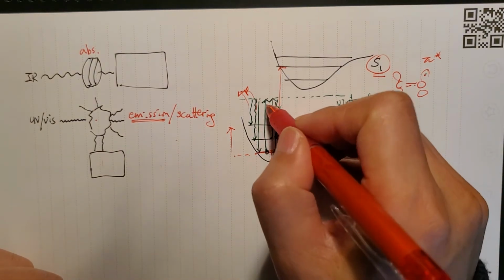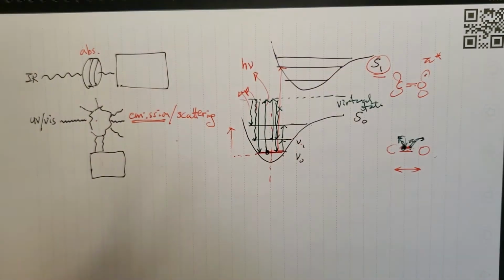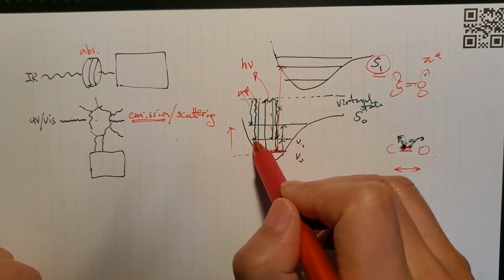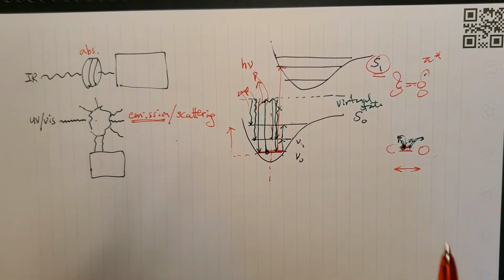So let's say the original energy we used here had frequency h nu, from the Planck energy equation, right? Then this energy here that reaches the original state will be identical, right? So you absorb such an amount of energy, you come down and spit out the same amount of energy as a photon.